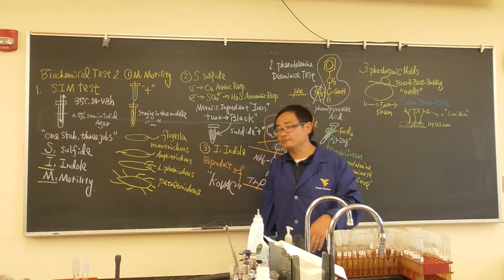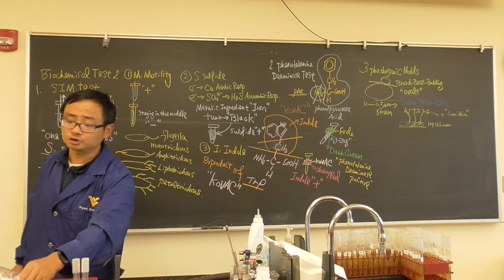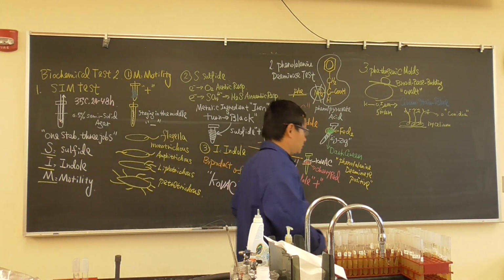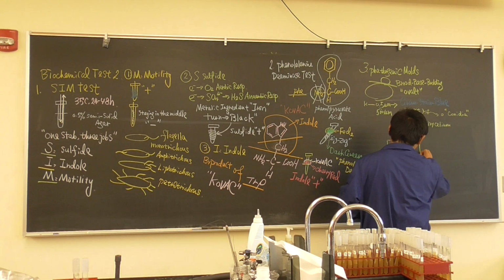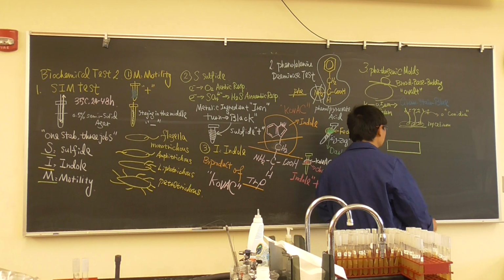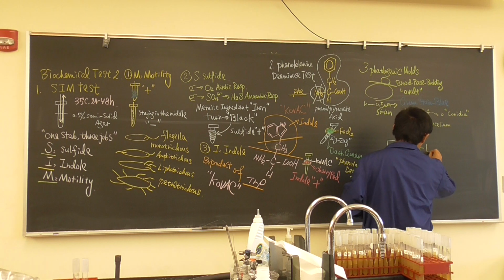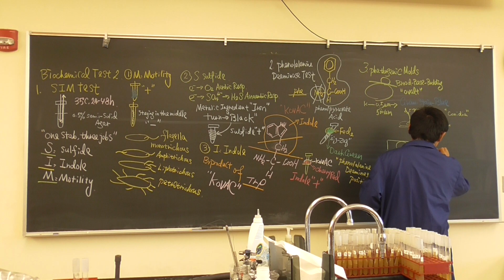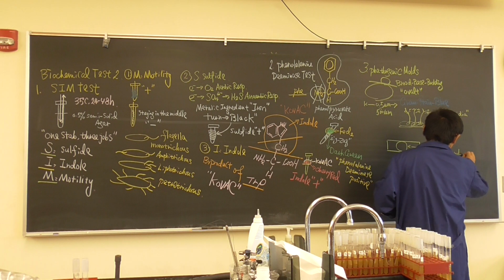Now we have this very moldy bun. What are we going to do? We are using a very simple test, not difficult. We get a glass slide. Right in the middle of the glass slide, we're going to add one very special dye, lactophenol cotton blue.